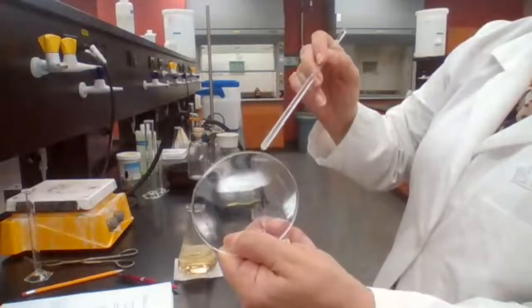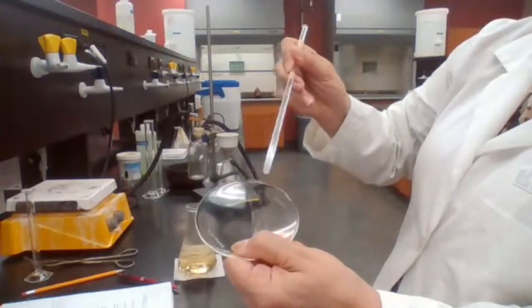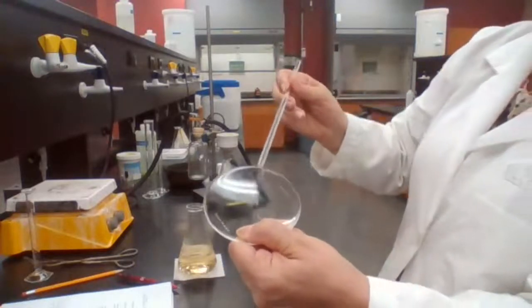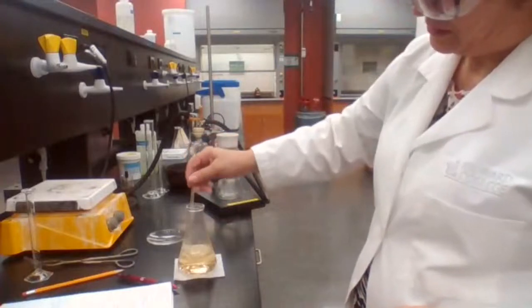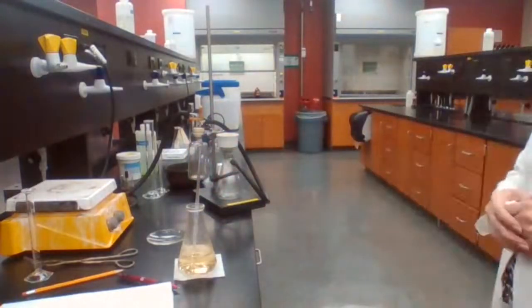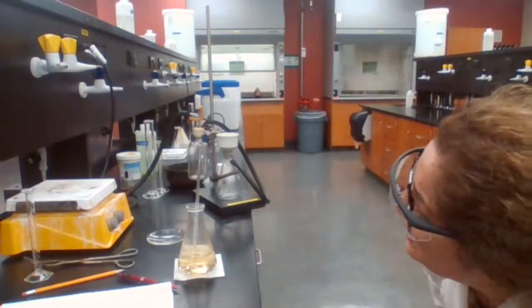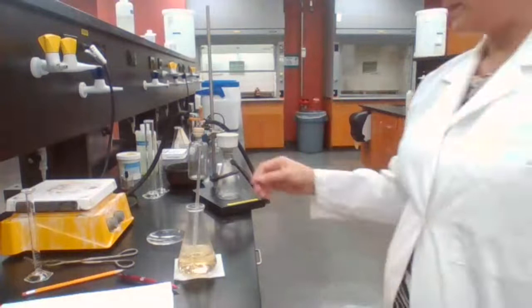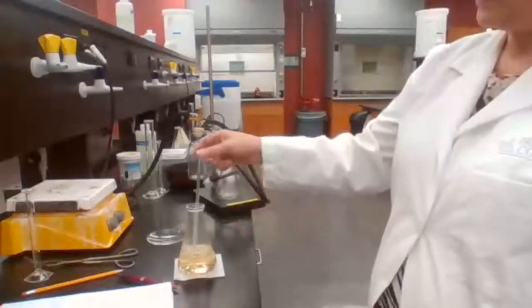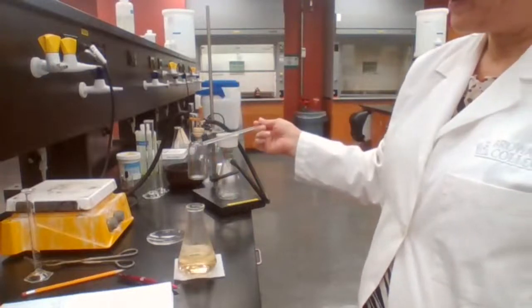If I scrape it here, you could actually see pieces on the edge of the watch glass. That's all we need, just a very tiny piece of particles, which is going to be good enough for crystals to form. It's too hot yet, so I don't expect the crystals to form. At the same time, with a good solvent it is not going to take too long for it to form. And when I see the crystals, then I can actually place it in an ice bath.